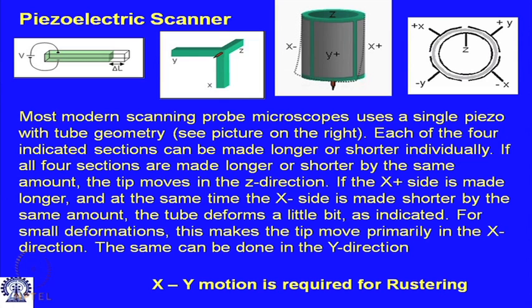But very briefly, if you apply a voltage to a piezoelectric material, there is a dimensional change. Let us say you apply a positive voltage, it might become longer and consequently thinner, and if you apply a negative voltage, it might become shorter and consequently the cross section becomes wider. So, this is in a nutshell a piezoelectric element.